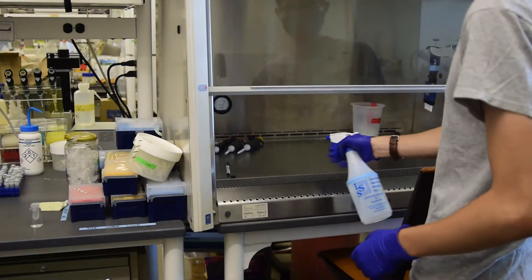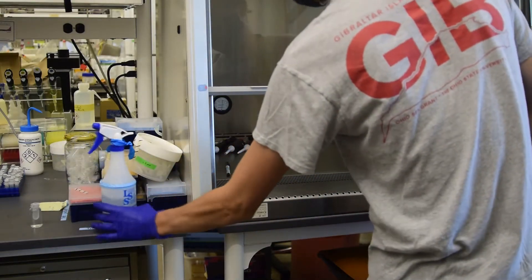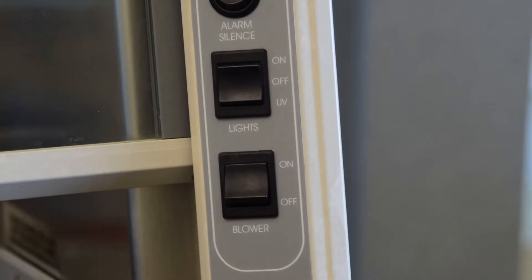Clean the pre-PCR hood space with ethanol, allowing it to evaporate. Opening the sash should automatically start the blower; otherwise flip the blower switch on. Turn on the lights.